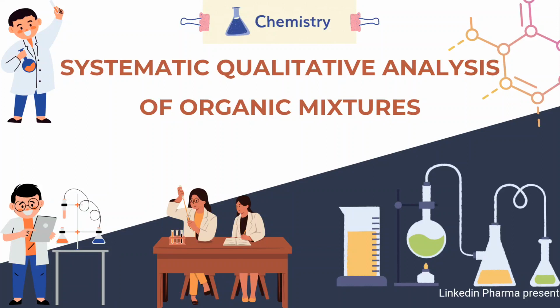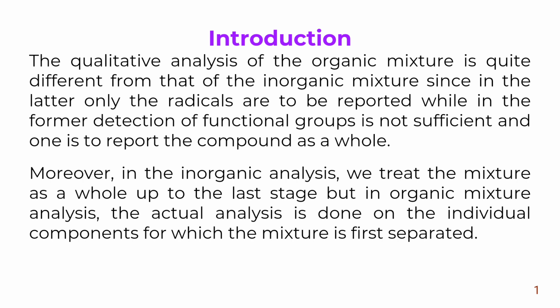Systematic qualitative analysis of organic mixtures. Introduction. The qualitative analysis of the organic mixture is quite different from that of the inorganic mixture, since in the latter only the radicals are to be reported, while in the former detection of functional groups is not sufficient and one has to report the compound as a whole.